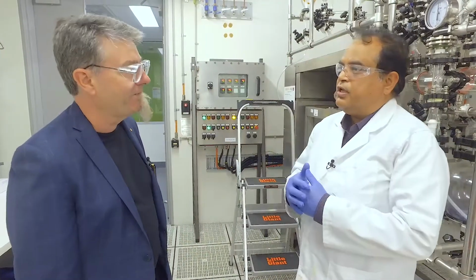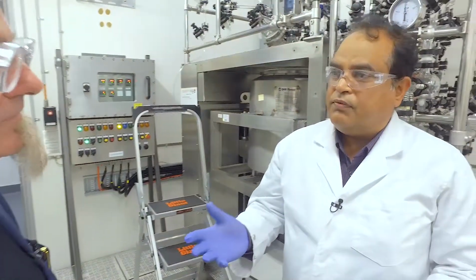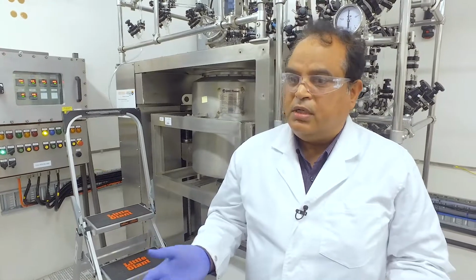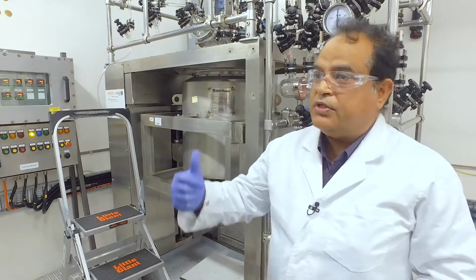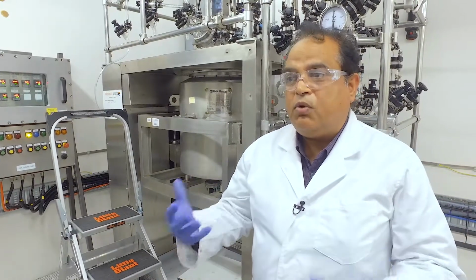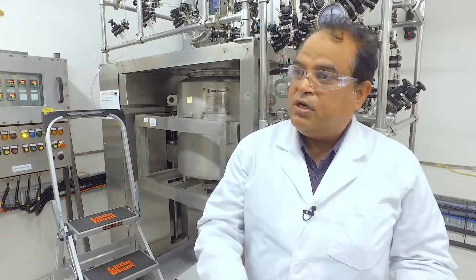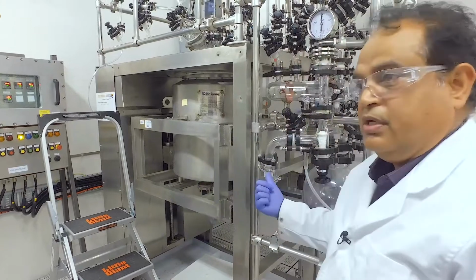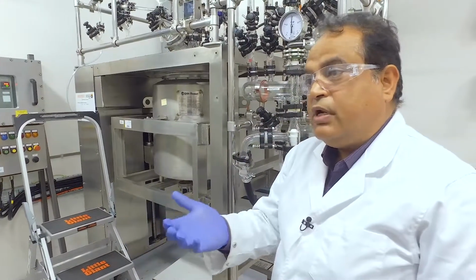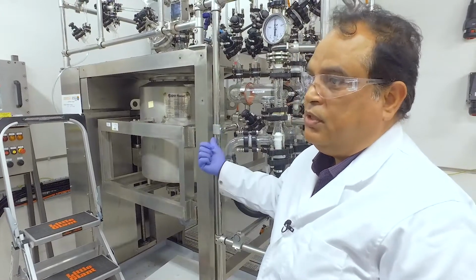Yeah, Gordon, on the laboratory scale, when we are doing the oxidation, we are creating defects, we are putting in oxygen, and the material after oxidation is an insulator. So how many oxygen functionalities we put in matters. Now, when we are scaling it up, we have to produce the similar quality that we were getting on the laboratory scale, and that's how we will get the final product which we were using before. So it is very important to optimize the parameters here. The parameters were easy to operate on a laboratory scale, but it might be difficult to operate them here.